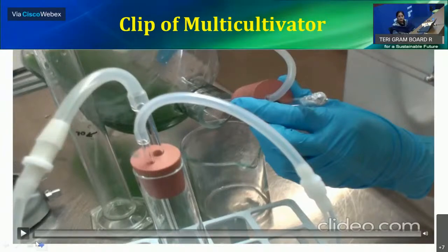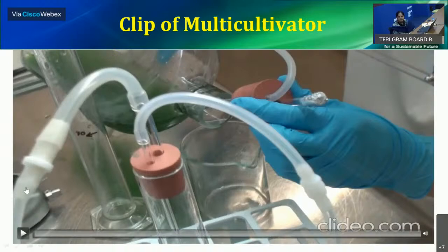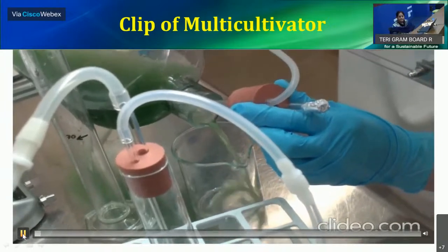So what is this? This is a multicultivator where we grow the algal strains, and in this multicultivator we have 8 panels which can take 8 different species at the same time, and they can grow at 8 different temperatures, 8 different light regimes, and 8 different photoperiods. So you can use this equipment for bioprospecting of the algae. I'll just play this 1 minute.